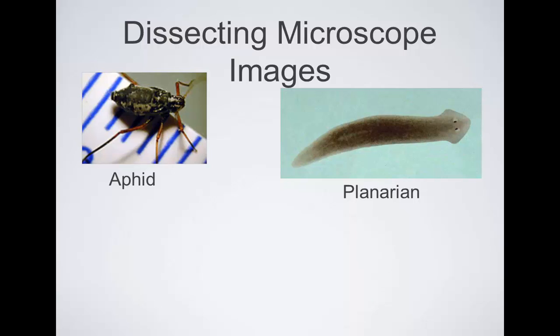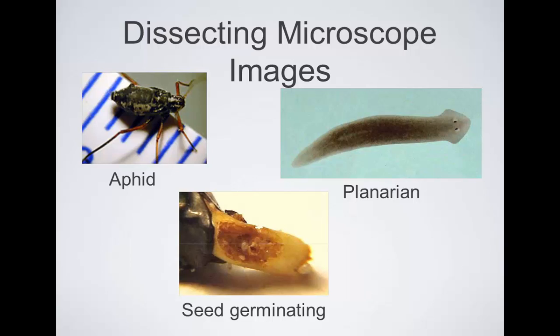This is a planaria. It's a flatworm. We will look at that planaria later in the year. This is a seed just beginning to grow, a seed that is germinating and breaking out of its seed coat.